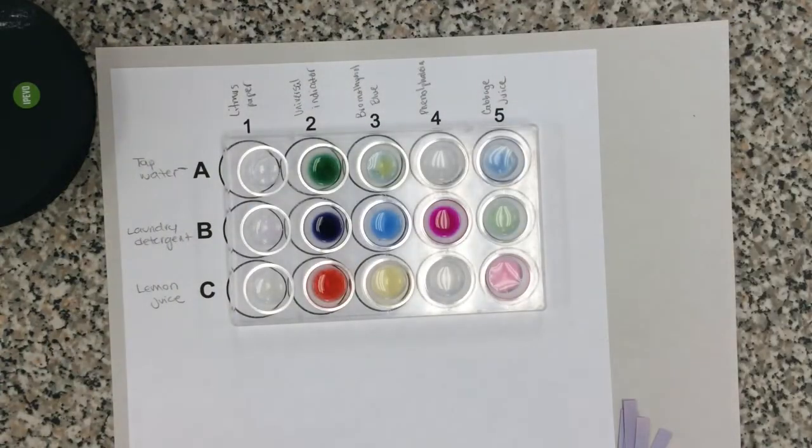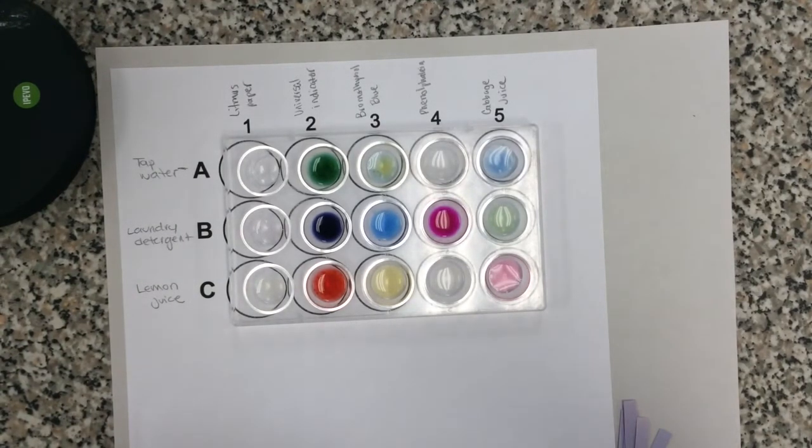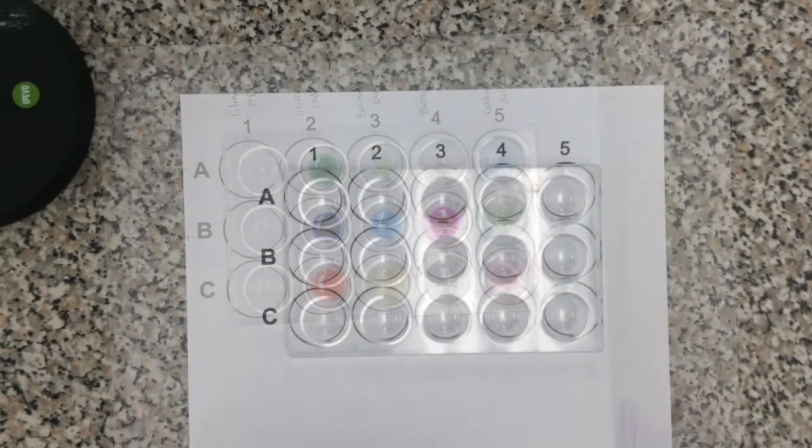All right, so now I'm going to dump this out. I'm going to rinse it and dry it really well. We don't want to have any residue left in our well plates because we are now going to try our next three samples and we do not want them to be contaminated. All right, so I'll be right back.